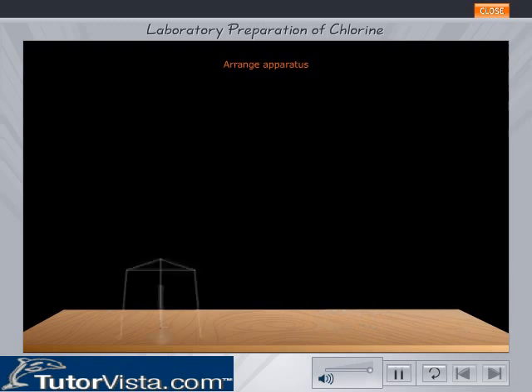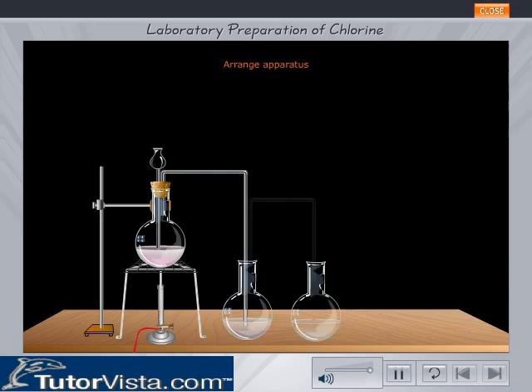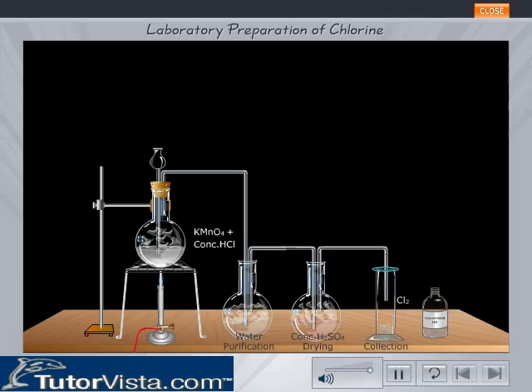Arrange the apparatus as shown. Add a few drops of concentrated hydrochloric acid to the potassium permanganate solution through the thistle funnel. Observe the reactions that take place.